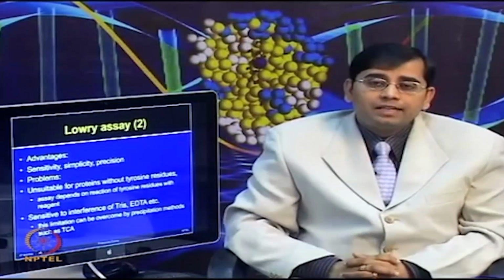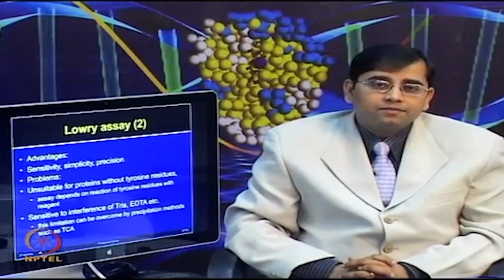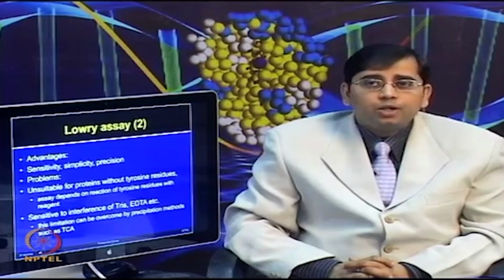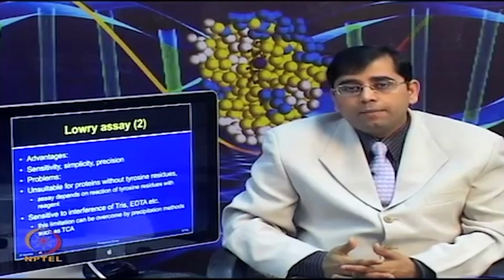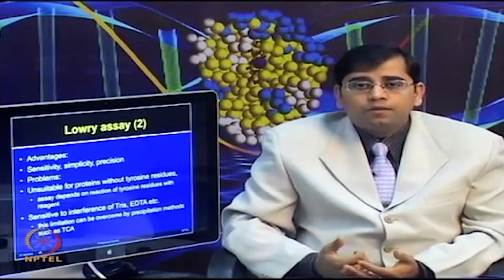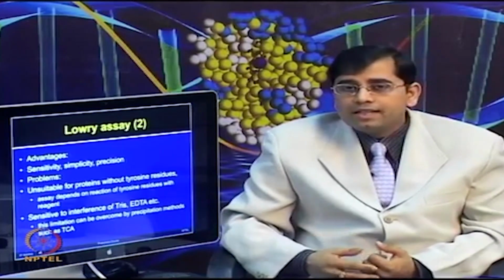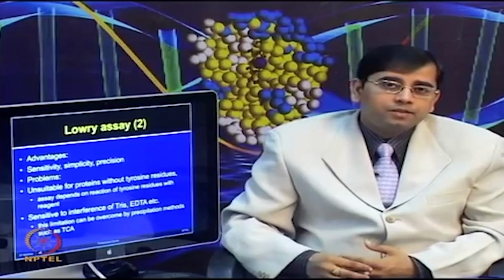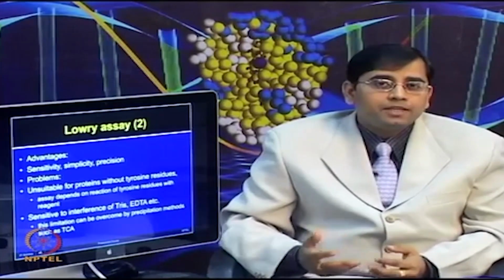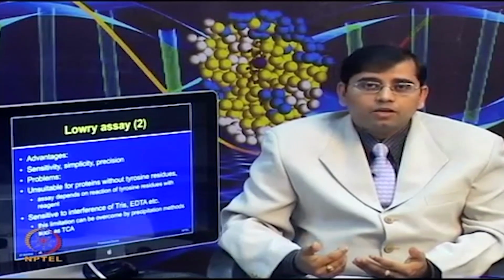This method is very simple, very precise and very sensitive. These are various advantages of using the Lowry assay, and that is why when people have abundant enough proteins in their samples, they have conventionally used the Lowry method. But if you are using clinical samples or samples with very low yield, this may not be the best method to use, and that is why there are other methods available.